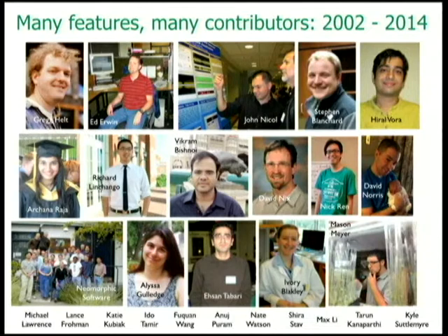So there are many more features I don't have time to talk about. And I want to mention that there is a good reason that there are a lot of features. That's because the application has been developed since the early 2000s, and we've had a lot of people contribute over the years. So up at the top left is Greg Helt, who wrote the original version while working at Affymetrix. And the original aim of the software, as it was developed at Affymetrix, was to accommodate big data.